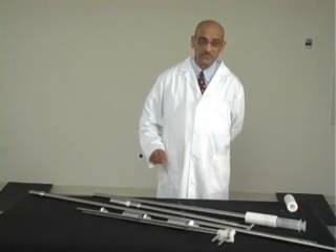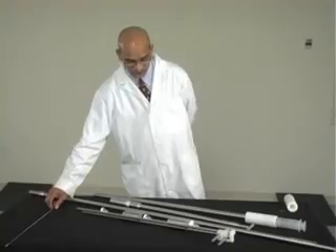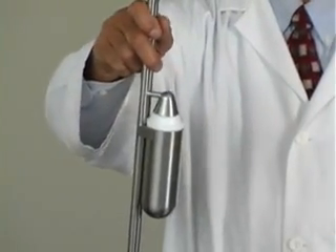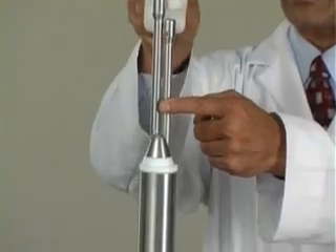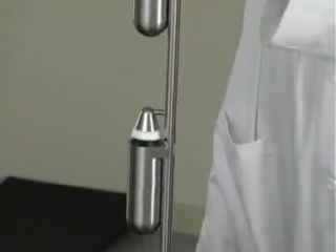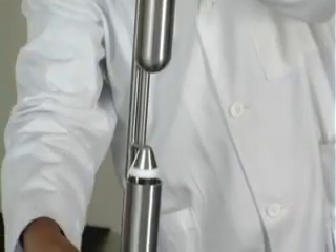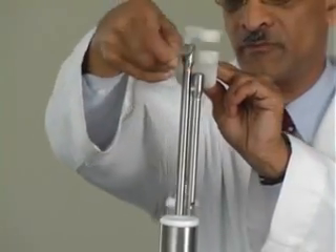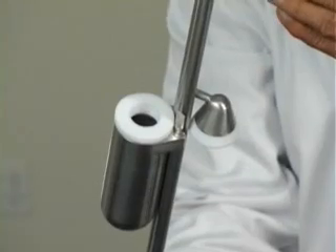I will show the details of each of the designs and how each one can be used to obtain liquid samples. This here is model 7, multi-cup liquid sampler. As you can see, there are two shafts here. One shaft actually holds the cups, and the second shaft holds the caps that go on the cups. When you turn this shaft out of the way, the cups are exposed to collect the liquid samples.